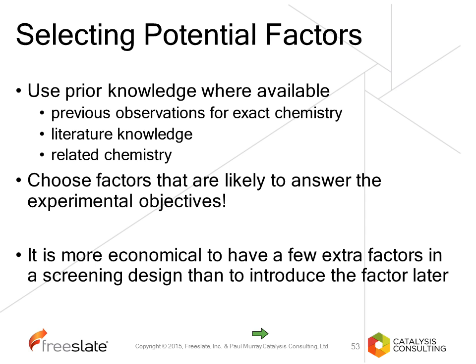We will see shortly that it is far more economical to look at many factors using screening design. If you skip a factor, if you fix a factor and later find that it is important, you may have to go back and start from the beginning because you don't know how that factor may interact with other factors.